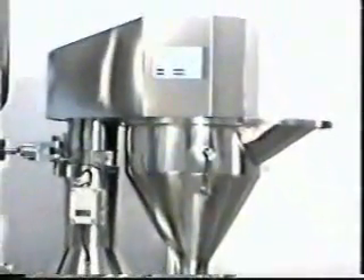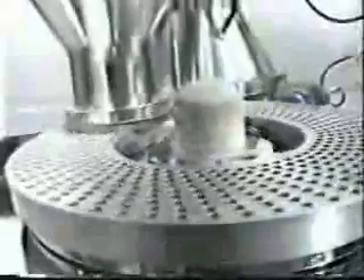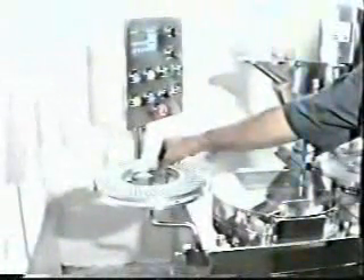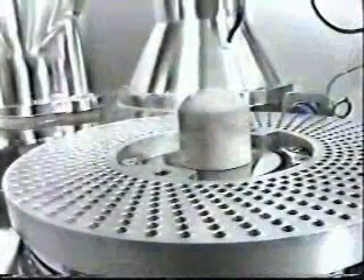After the desired product has been charged in the powder hopper and the capsules have been separated, the filling process begins. On the completion of capsule loading operation, place the capsule set on the filling table. Remove the cap ring and place it on the set of items on the left side of the machine. Now the body ring is ready for filling.